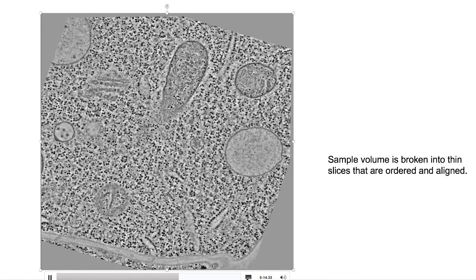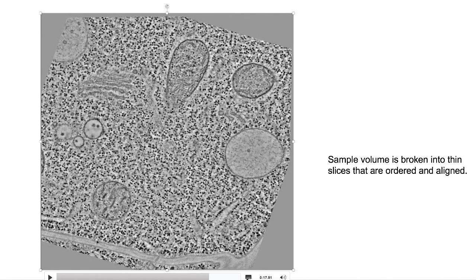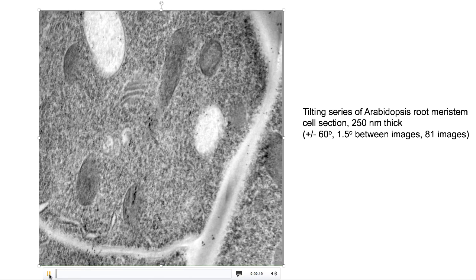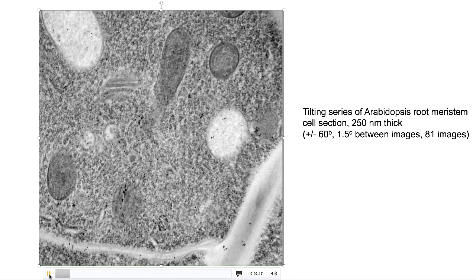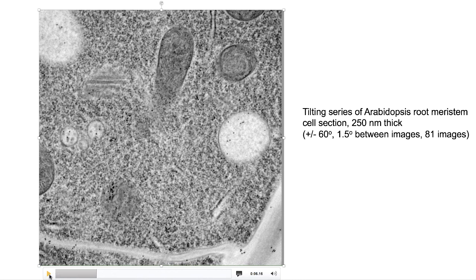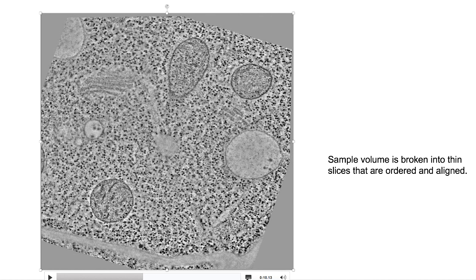When you compare the individual slices of the electron tomogram with this image, you can see the increase in resolution by doing electron tomography.